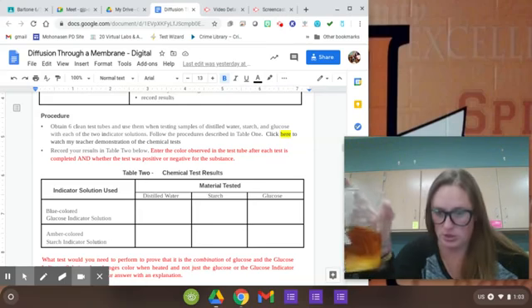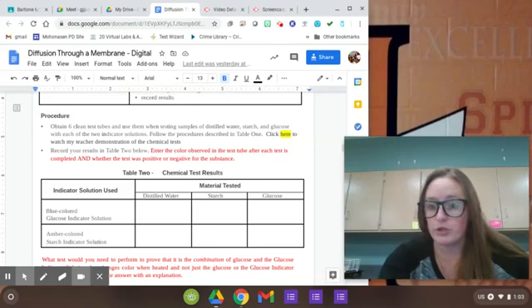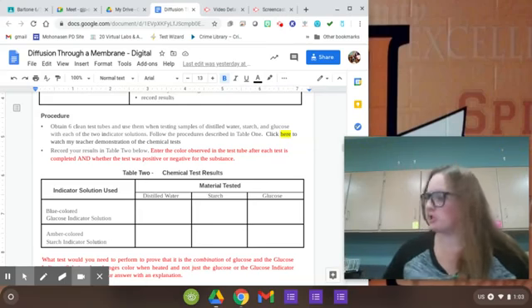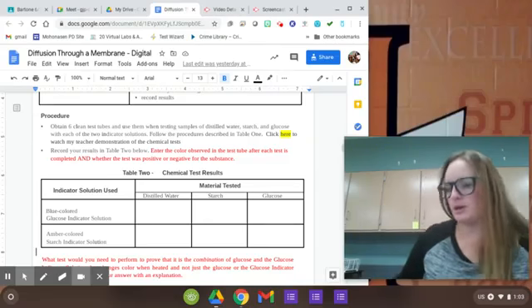We are going to see some changes occur in this beaker. And the trick here is to know, okay, what do those changes mean? What does it tell us? What information do we gather from this? Kind of like the boiling water example that I was talking about.